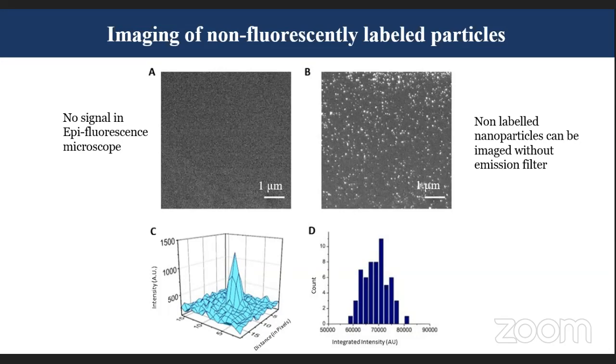However, if these particles are observed using the SeeTB setup which we have made, and if we remove the emission filter, you can see that the scattered light generated from each nanoparticle is very nicely observed using this device in a simple microscope.